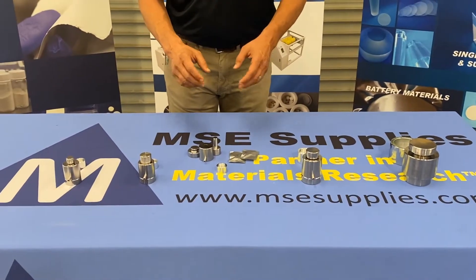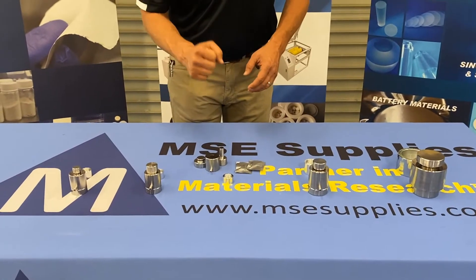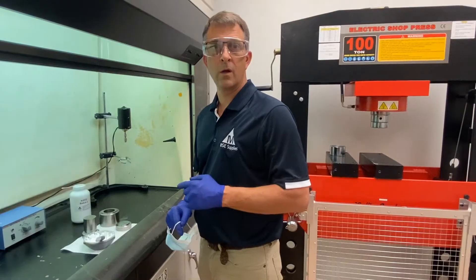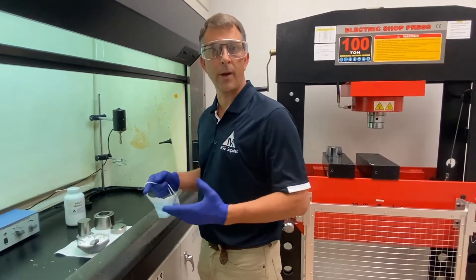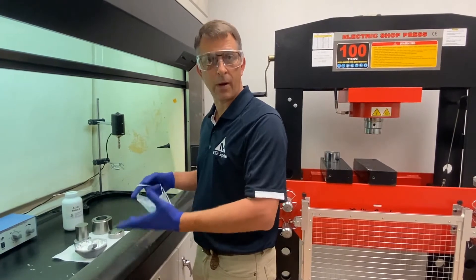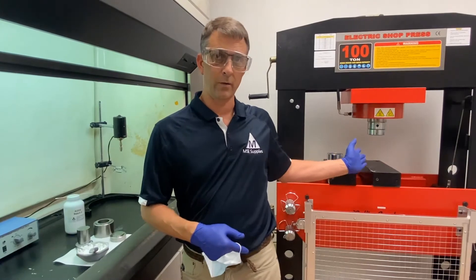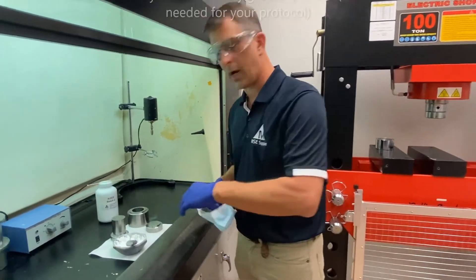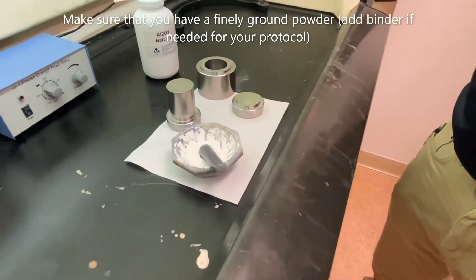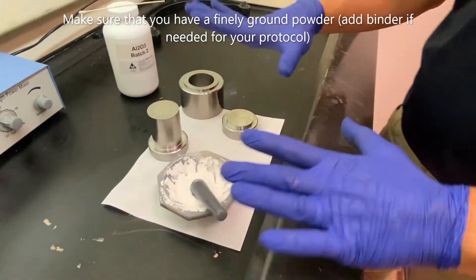From here, we're going to show you how to load and actually press a pellet. Now that I've shown you the parts of the pellet press dies, I'm going to show you how to load it and pelletize the powder using the die and this hydraulic press. We've already made a powder — this is aluminum powder, we put some binder in there and mixed it all up really well. That part you can do on your own.